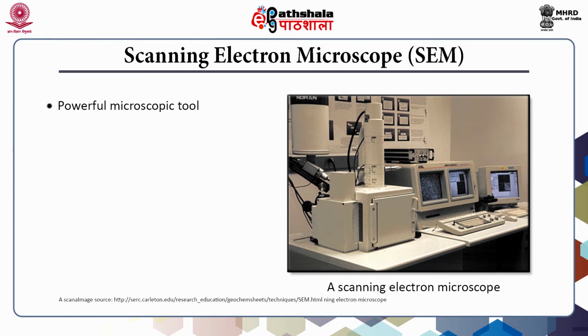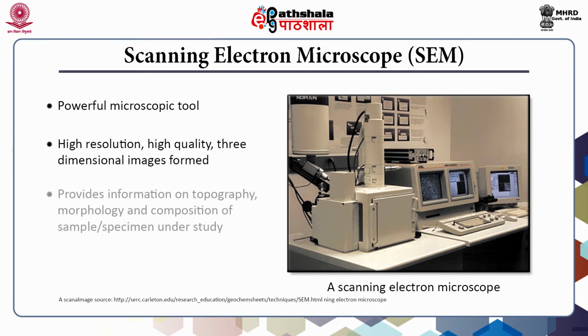It is a magnification tool that produces high resolution, three-dimensional images which provide information on topography, morphology, and composition of the sample or the specimen. The information so obtained helps assist in a large number of science-based and industrial applications. The scanning electron microscope was developed by Dr. Charles Oatley.